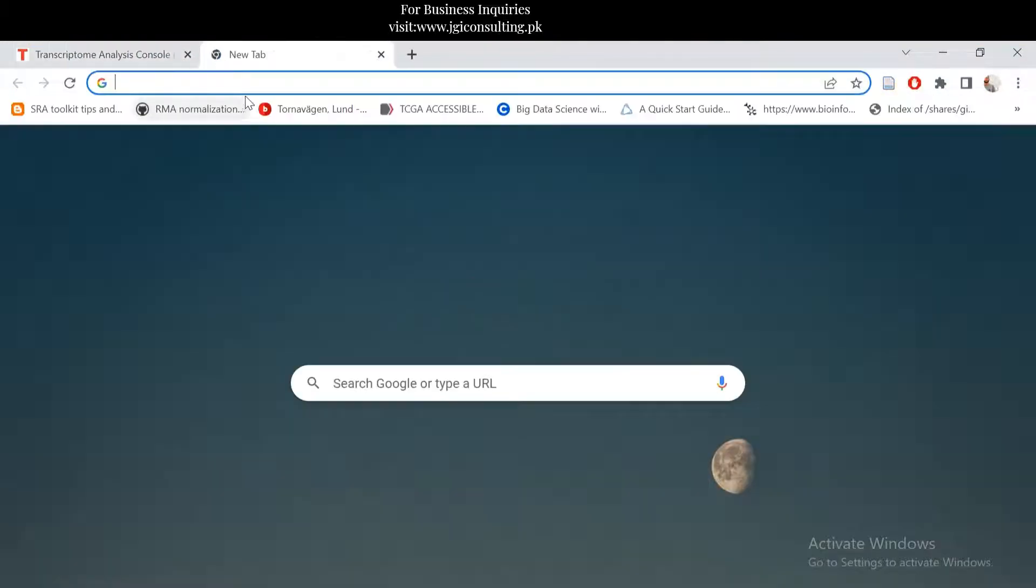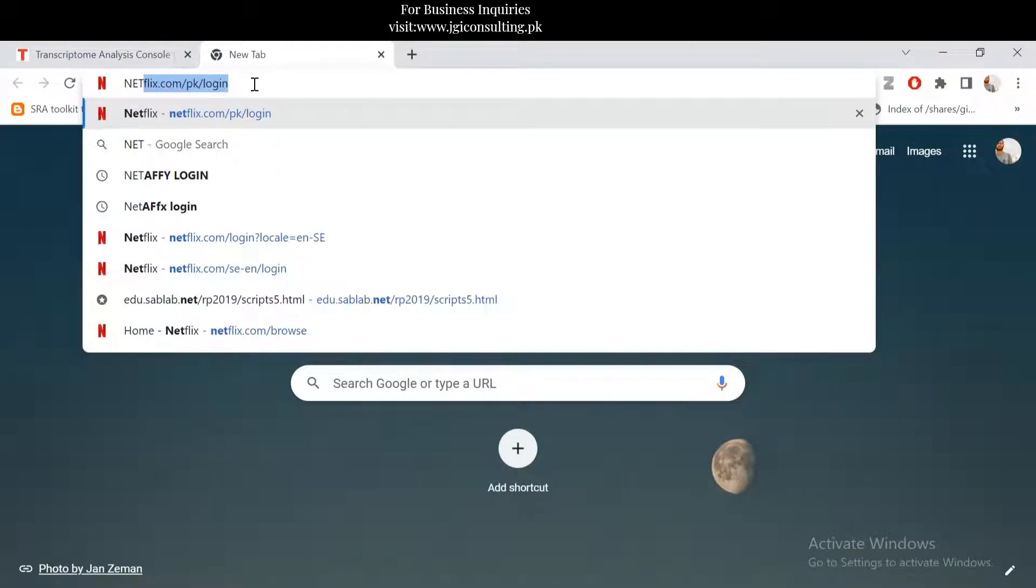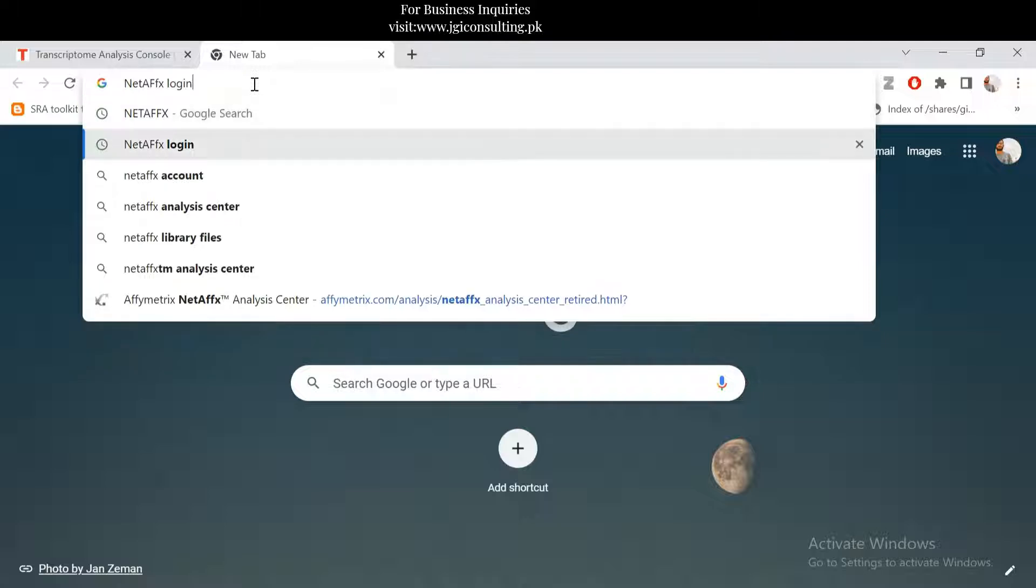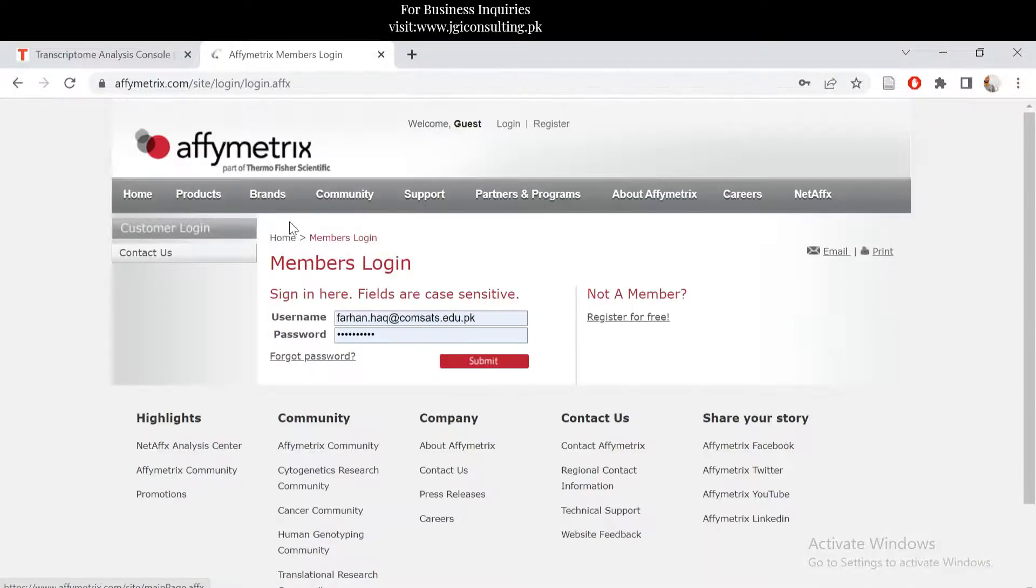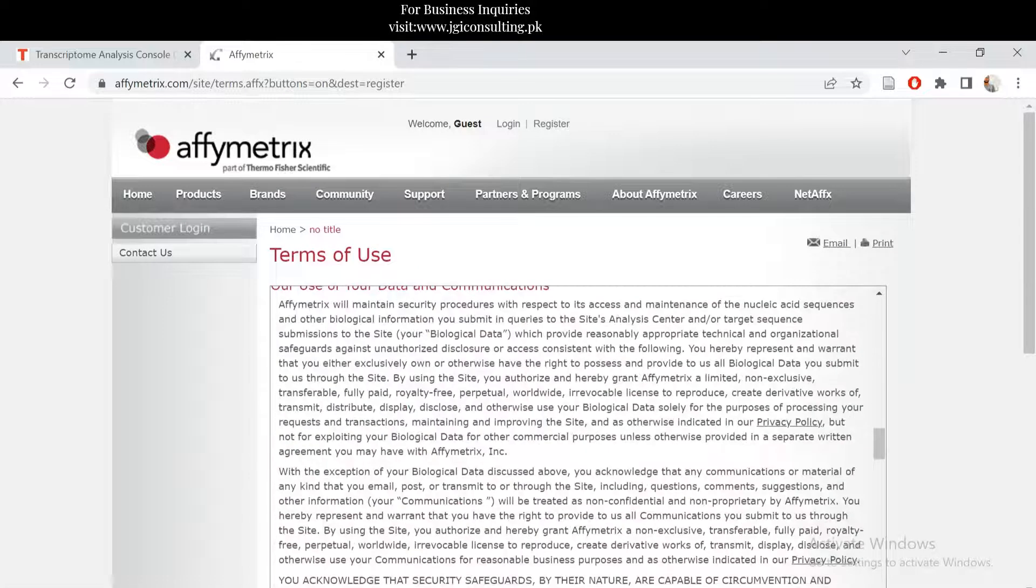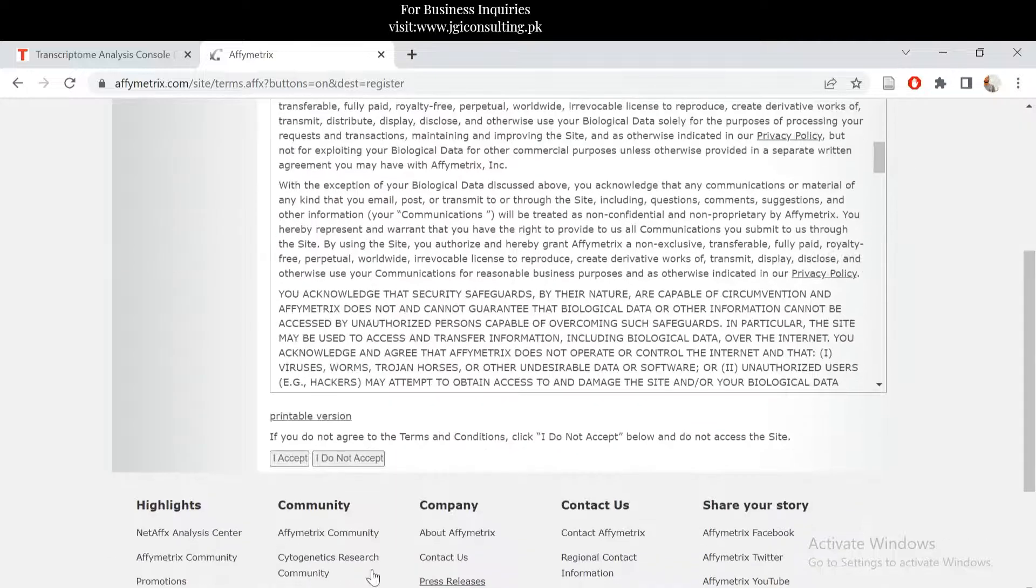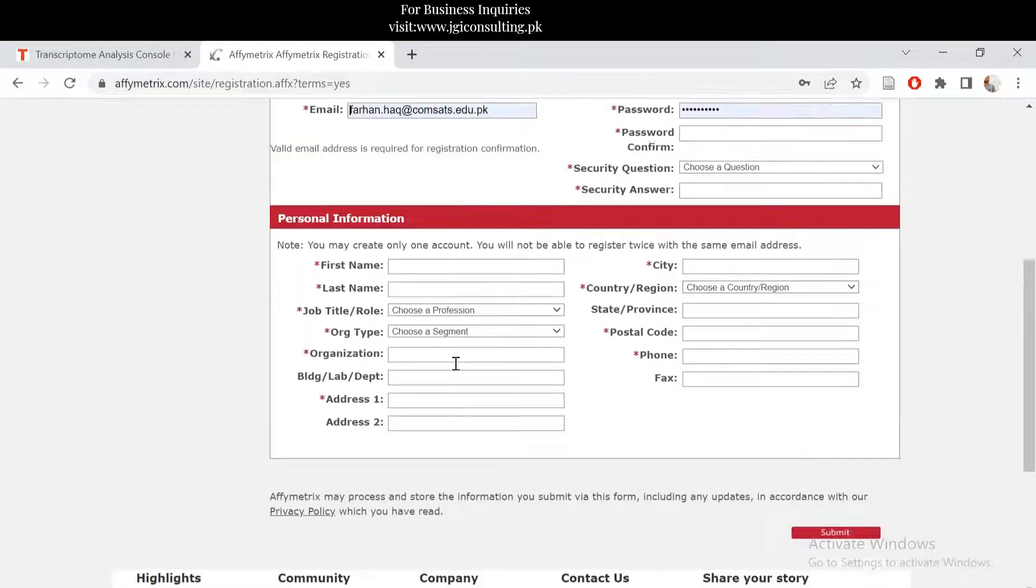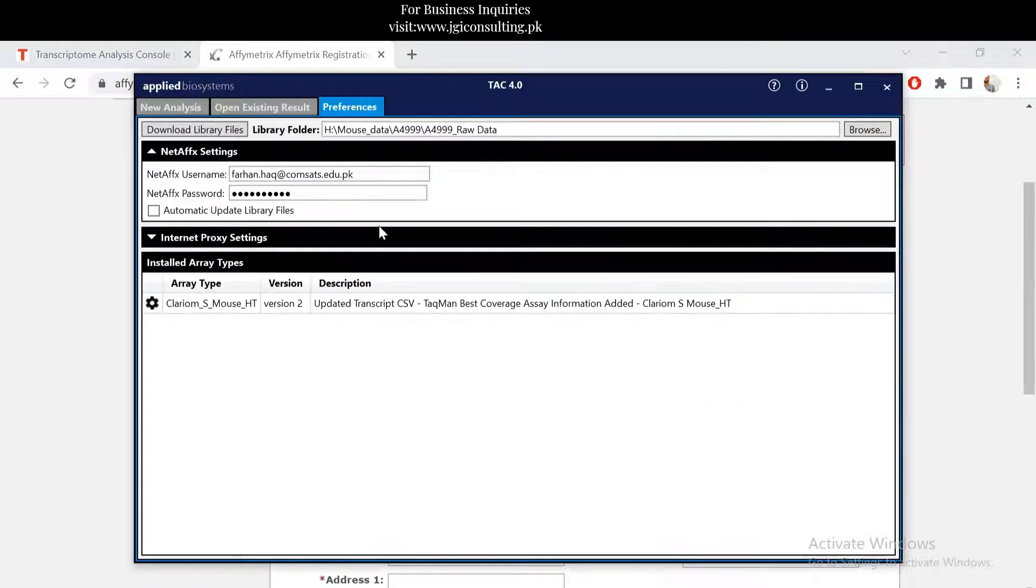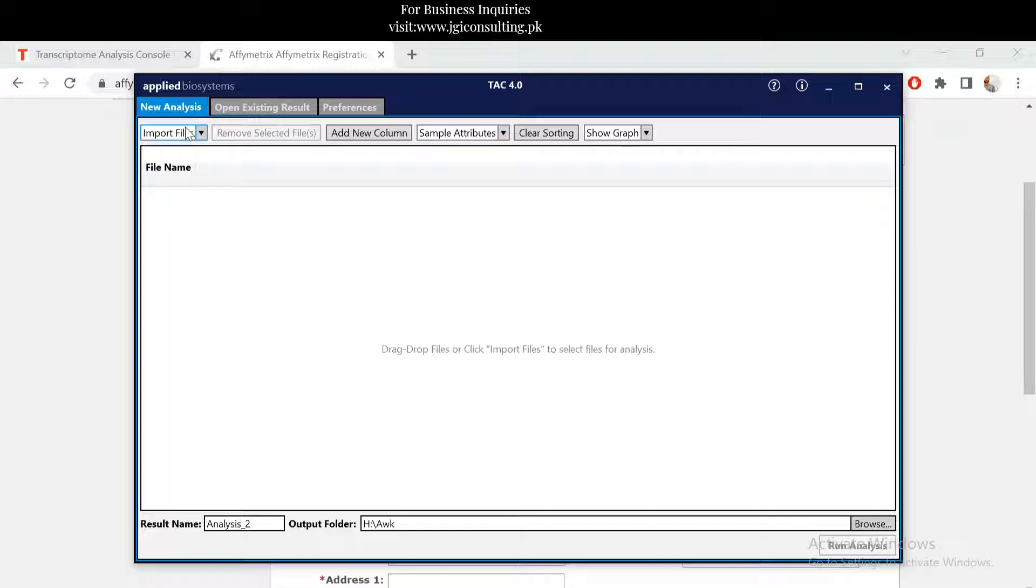The NetAffx ID is like you can check here NetAffx login. If you have a member account, then you can just log in here. Otherwise, you can register for free here, accept all the conditions from here, and then you can fill in the form and submit that. Then you will have a username and password, and that username and password you have to put it here and then everything is ready.